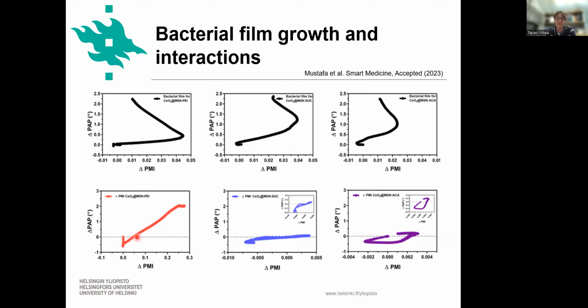And we can see for the positively charged particle, it's completely different behavior than for the others. And in the future, it would be nice to look into more particles to see if we could somehow be able to predict the mechanism of action of these particles with biofilm.